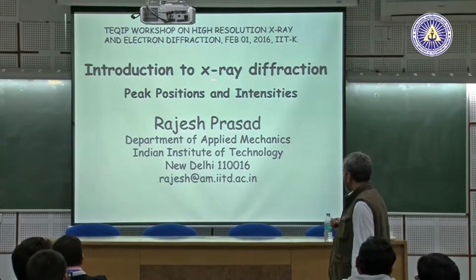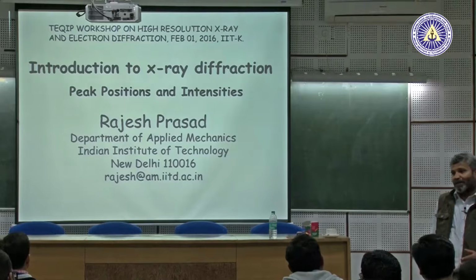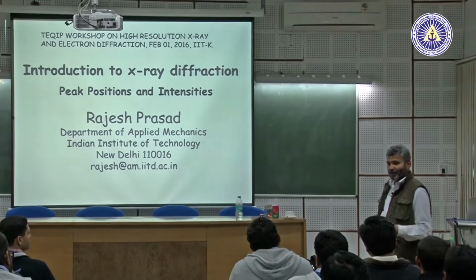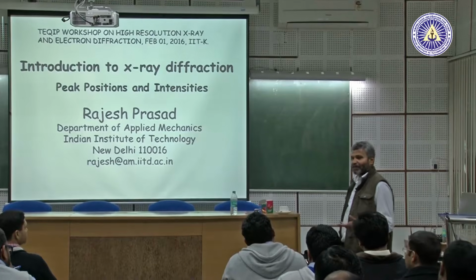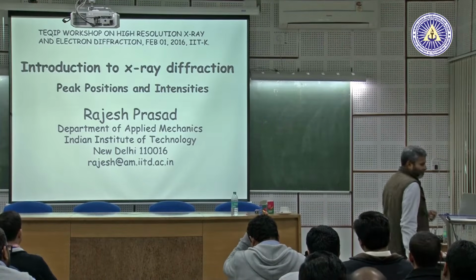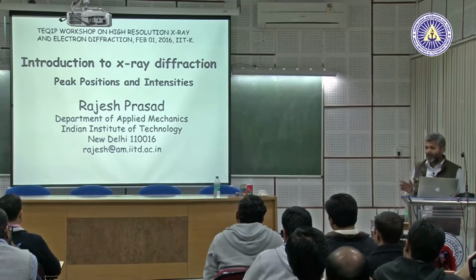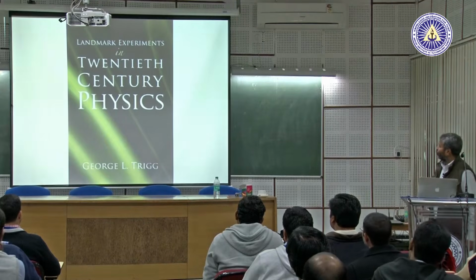In fact, it was such a successful experimental technique for crystallography that initially crystallography itself was given the adjective X-ray, and people had books or courses on X-ray crystallography, the crystal structure as determined by X-ray. Of course, there are other diffraction techniques, neutron diffraction, electron diffraction and so on, but the basic technique for crystallography is X-ray diffraction. So, it is very, very interesting. The history is even more interesting.